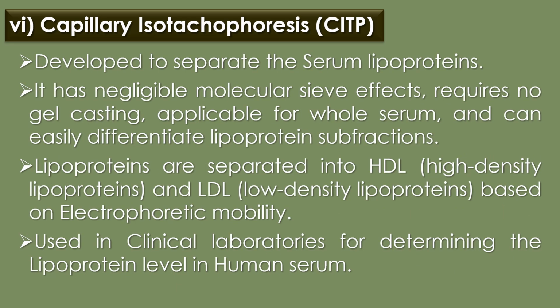The final and sixth capillary electrophoresis is capillary isotachophoresis. The capillary isotachophoresis technique was developed to separate the serum lipoproteins. Compared to other electrophoretic processes, it has negligible molecular sieve effects, requires no gel casting, is applicable for whole serum, and can easily differentiate lipoprotein subfractions.